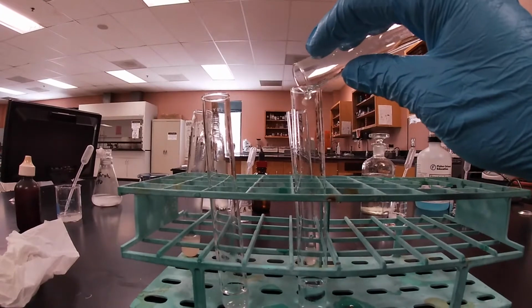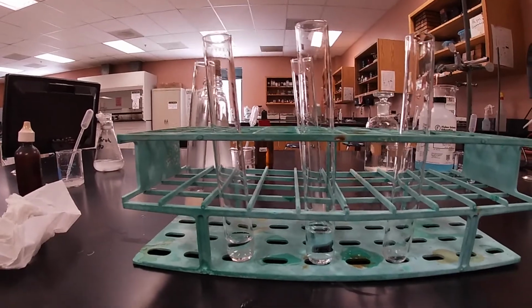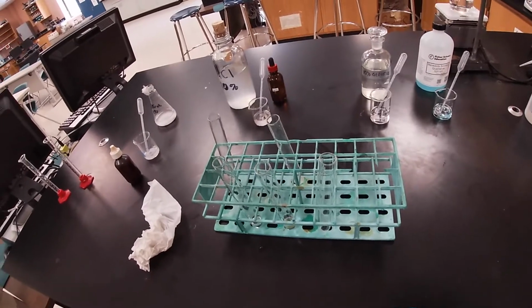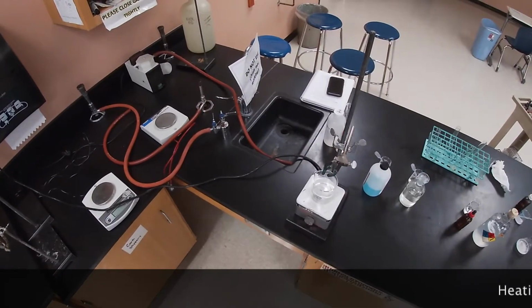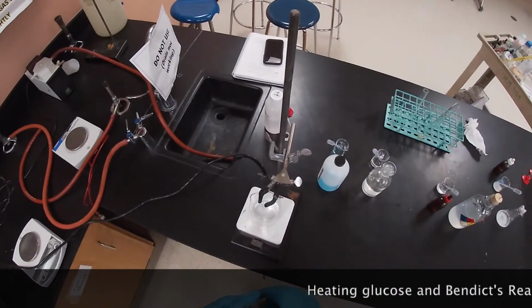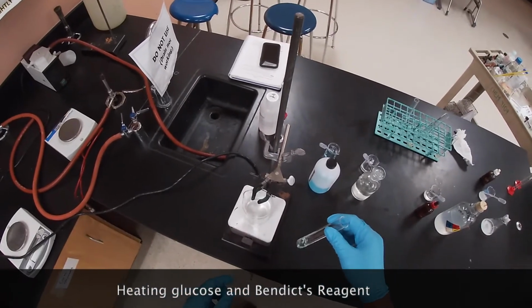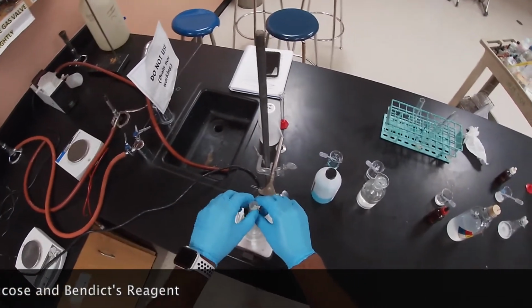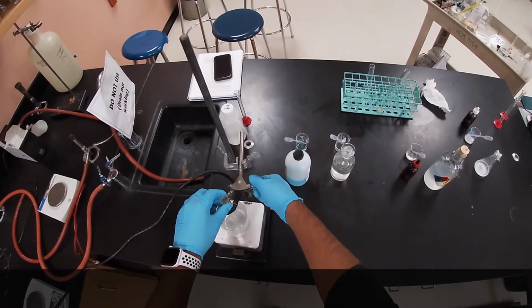Okay. Now then what we're gonna do is go to our warm bath, and we're gonna heat the test tube in our bath. Okay, give me 1 second. Okay, so here we have a boiling bath, and so it's just starting to boil. I started noticing the bubbles come up. It's not intensely boiling, but it will in a bit. And so what we're gonna do is set it in this bath, place our test tube, submerge it, and we're gonna heat for about 5 minutes.